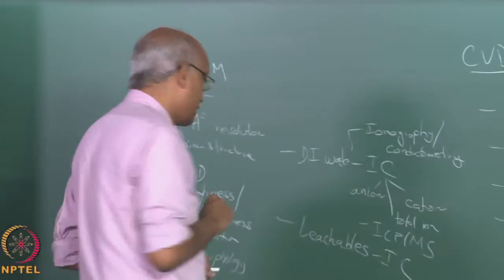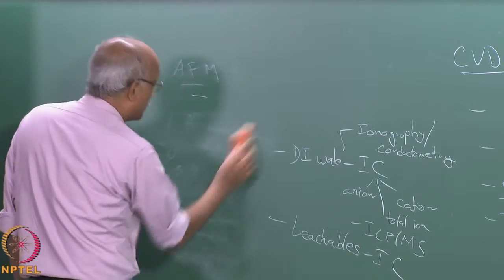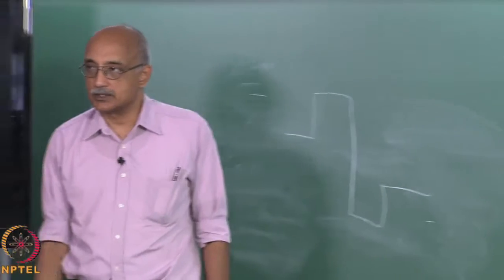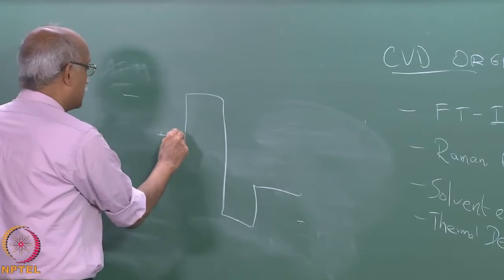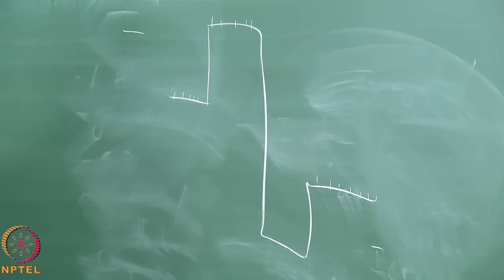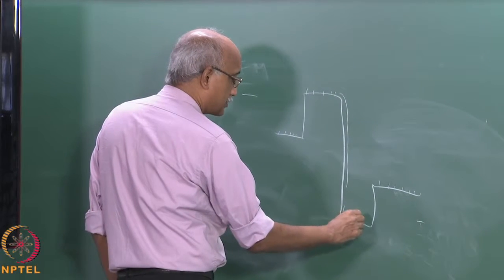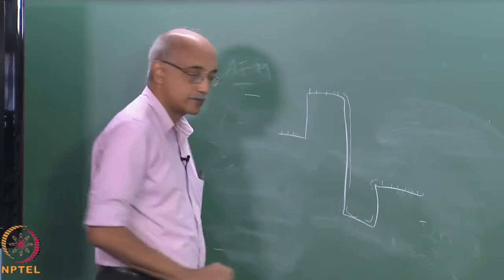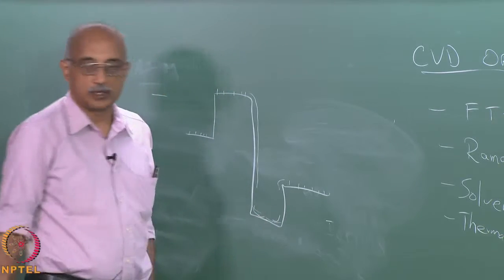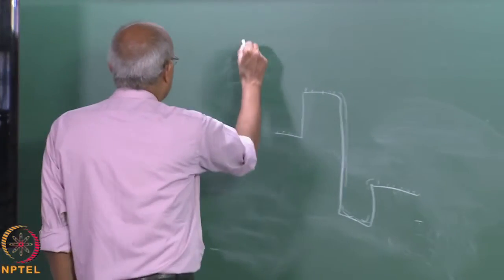This is especially important when you have surfaces with features on it, like deep crevices and so on. So if you are trying to coat a substrate that looks like this, obviously coating here is easy. But frequently, you want to know whether you are achieving a continuous film as you go through this transition or this transition or this transition. And you also want to know whether the vapors are getting far enough into the trench to also form a film at this substrate. So a technique that is used to assess this is called scatterometry.